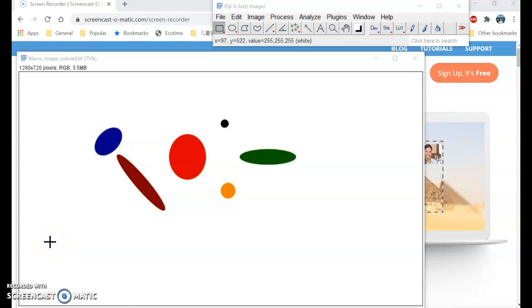Hey, Dr. Fu, I have automated the process of identifying the particles in the image, cropping them, and extracting them.